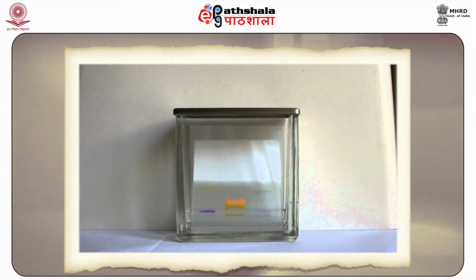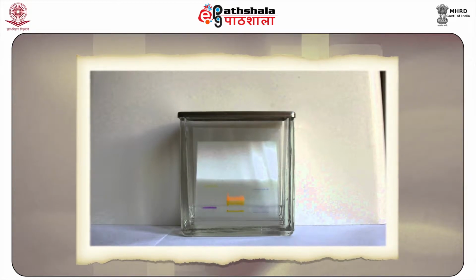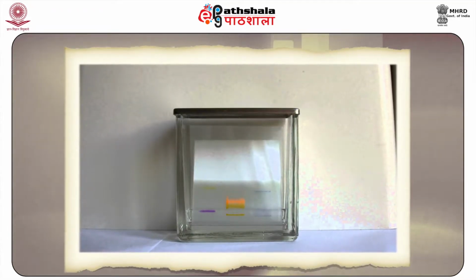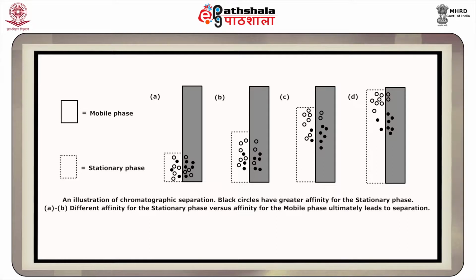Chromatography relies on the basic concept of differential solubilities and affinities of the different components of the mixture. The mixture that is to be separated out is dissolved in a suitable solvent called the mobile phase, which carries it through the second component called the stationary phase. Thus, choice of phases is purely dependent on the nature of the sample to be analyzed. Components having higher affinity towards the stationary phase will obviously get adsorbed sooner than those which have less affinity. Thus, the separation of various components of a mixture depends on their differential affinities towards the stationary phase.